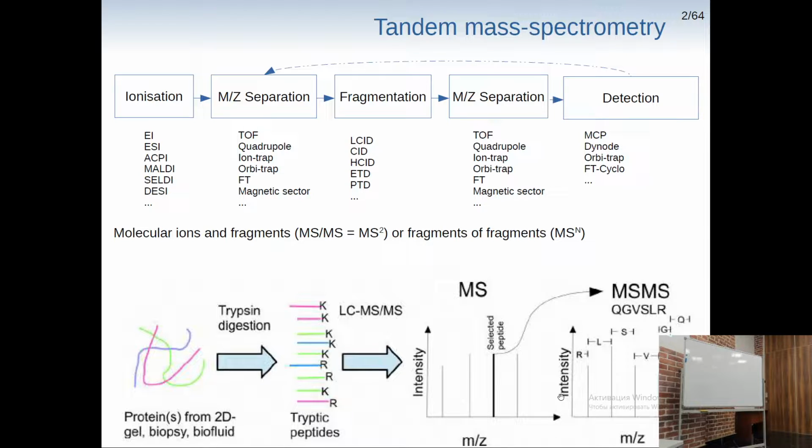But if you have, let's say, two unique peptides for some protein, can you say that you not only annotated it, but actually identified this protein? I think probably not, but we can say that the identification of this peptide was made by two peptides.